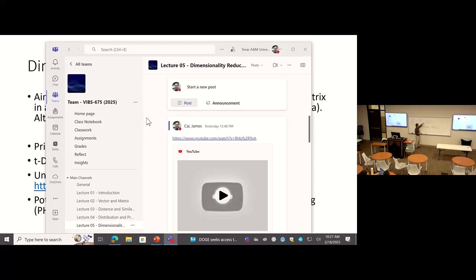your data points on the x-axis. Make sense? You can do the same for the y-axis. You just project your point to y and look at how long the projection is. You project to here, and also you sum those distances squared. That's a variation, a dispersion or variation of data points 1, 2, 3, 4 on the x-axis or on the y-axis. Make sense? You know how to do this, right?